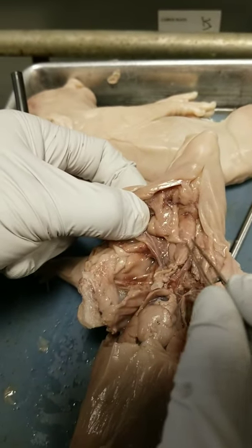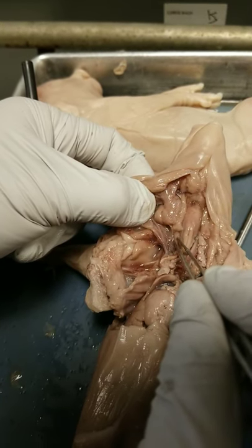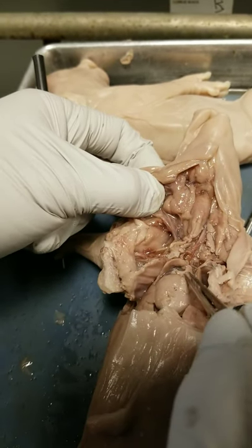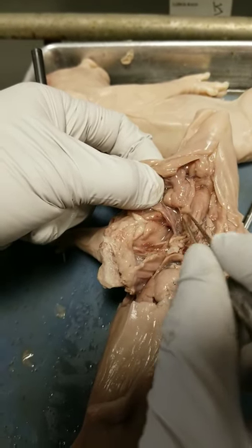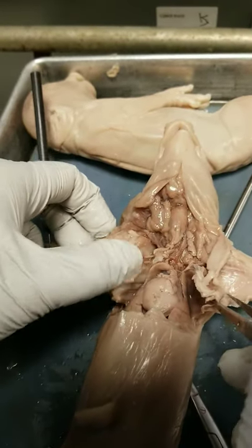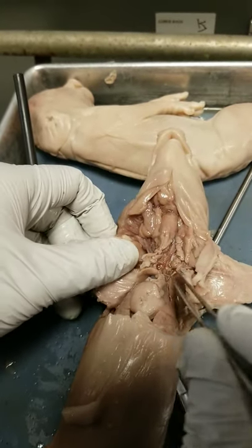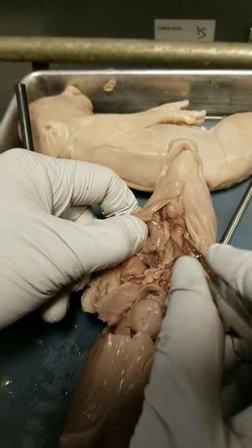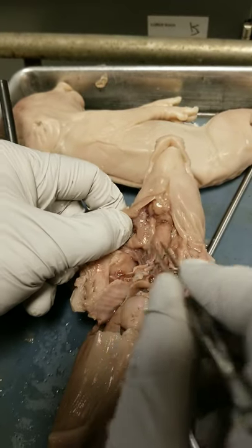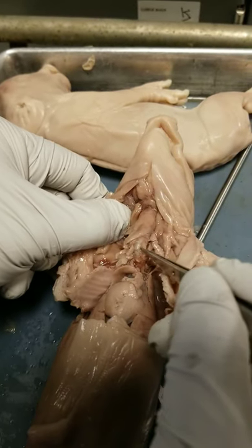If you look just lateral to the larynx and trachea, you'll find another squishy organ — that's the thyroid gland. Thyroid is by the larynx and trachea; thymus is by the heart. Thymus is an immune organ; thyroid is an endocrine organ. So once again, we've got our heart, lungs on either side, thymus, larynx, trachea, thyroid, and the esophagus hiding behind the trachea.